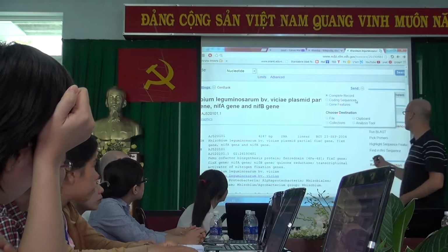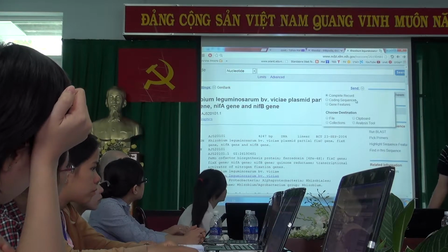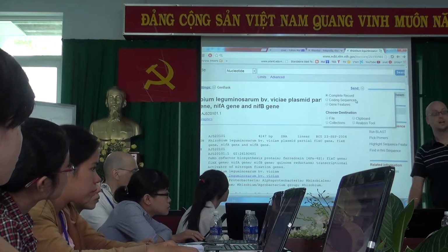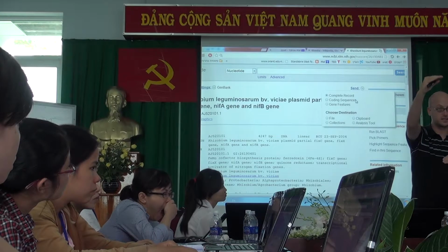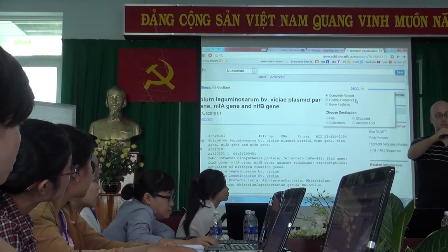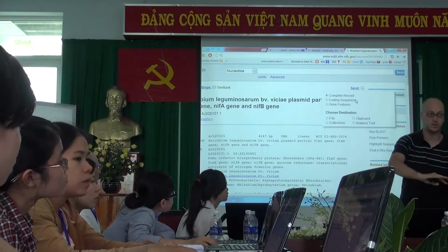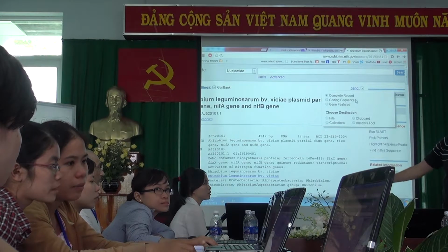now if we hit complete record, it will save everything. If we hit coding sequences, it will just save the coding sequence of fixC and the coding sequence of fixX and the coding sequence of nifA and the coding sequence of nifB, which was there below.